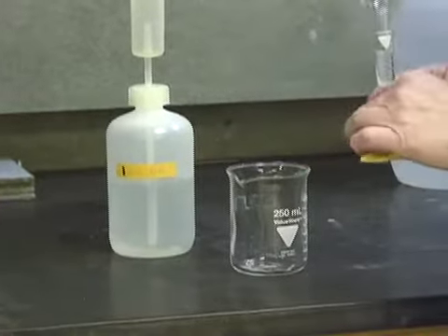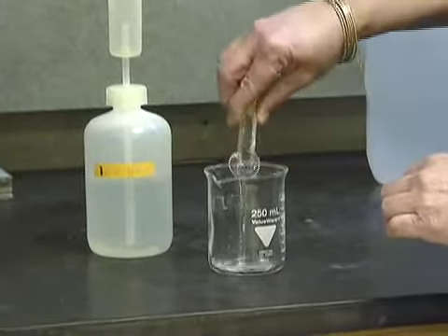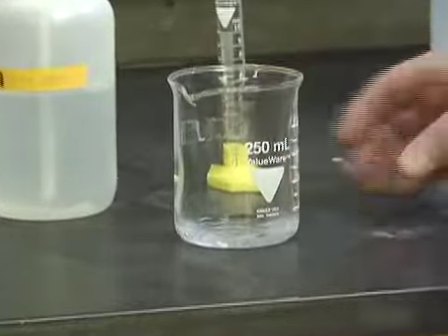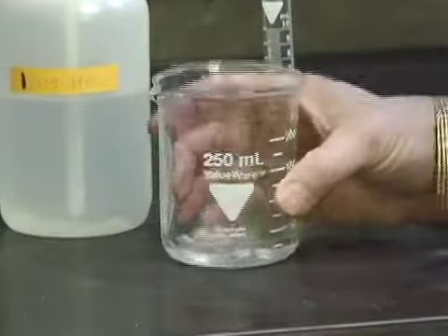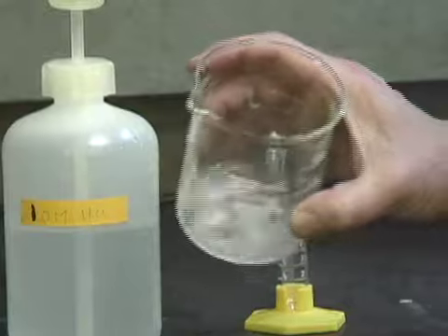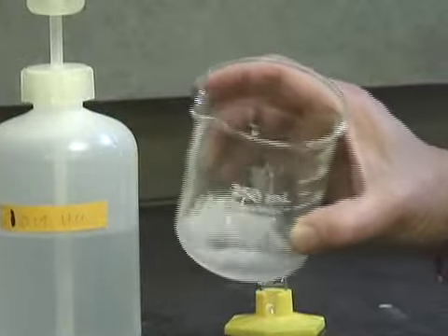And then I will add the acid to my magnesium, and oh, look at those bubbles. We got bubbles going on in there, and that hydrochloric acid is just dissolving that magnesium.